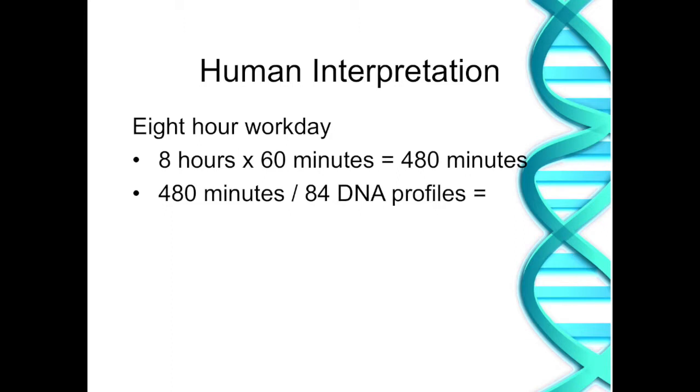So getting back on track, getting back to the DNA data, if we're looking at a full plate of data, doing so as to avoid any type of confirmation bias, how long is it going to take us to interpret that full plate of data? Well, if you work from a typical 8-hour workday, that calculates out to 480 minutes in the day. And let's say we're going to look at 84 DNA profiles.